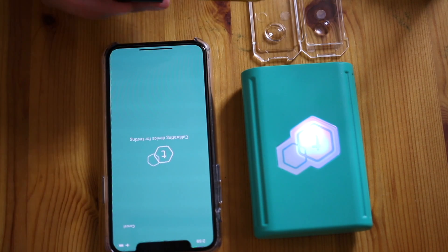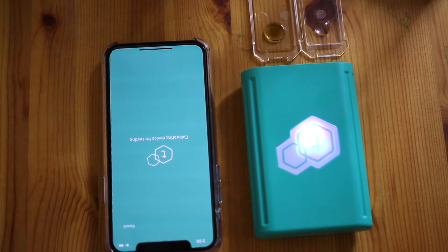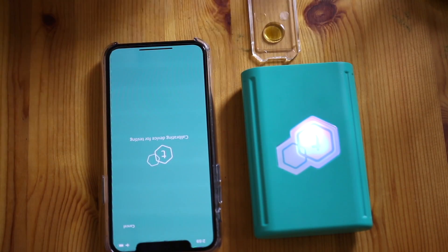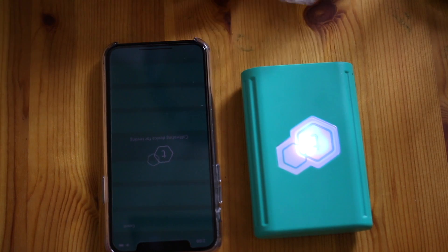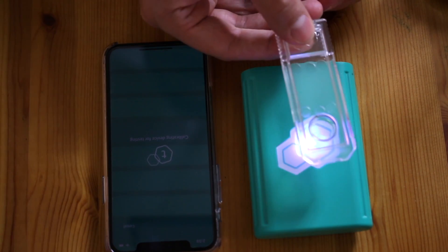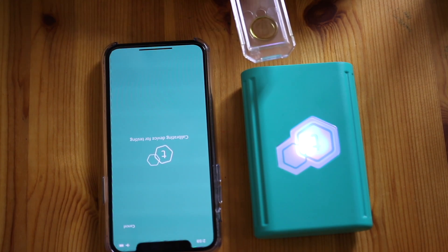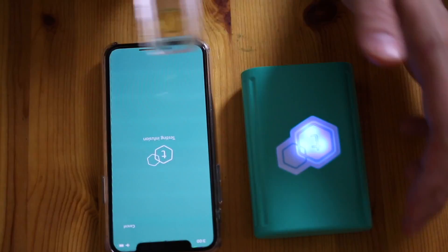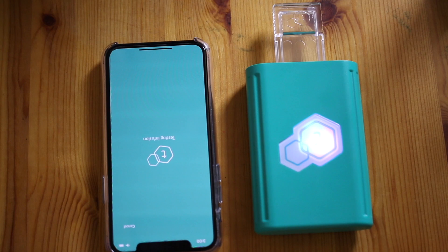While that's happening, I'm going to go ahead and take the dropper, fill it up with the cannabis-infused coconut oil. Close the slide. It's important to have no air bubbles here. You don't want to do too much, but you want to make sure you have enough so it's a nice clean looking surface. I'll try to put it over the light here so you can see. I just want to do this real time to show you how efficient this really is. It says insert tray — testing the infusion. Let's see how strong this oil is.